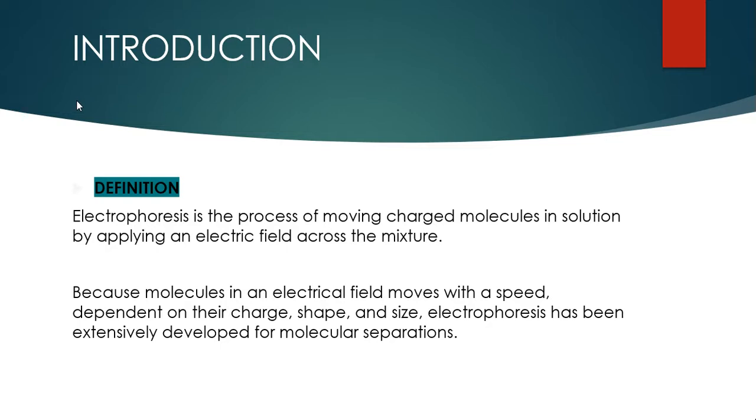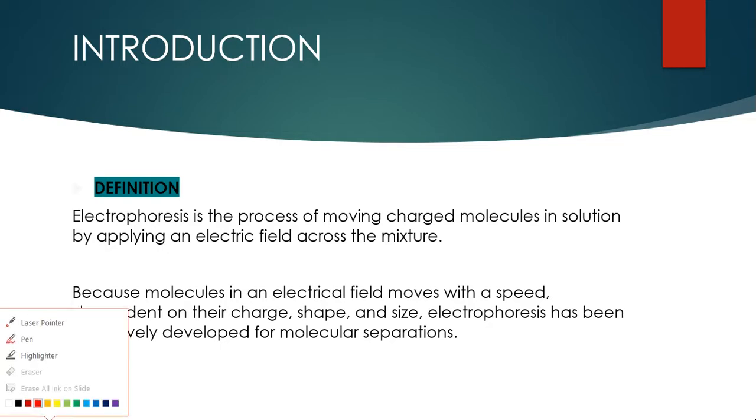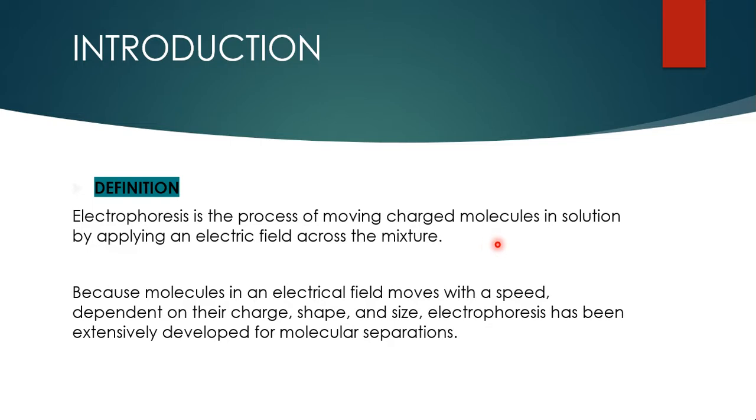So what is electrophoresis? Electrophoresis is a process of moving charged molecules in solution by applying an electric field. Remember, in general also the molecules are moving from one position to the other, but because of an electric field the charged molecules are moving. So electrophoresis is a process of moving charged molecules in a solution by applying an electric field across the mixture.